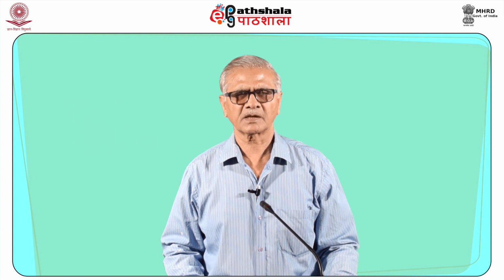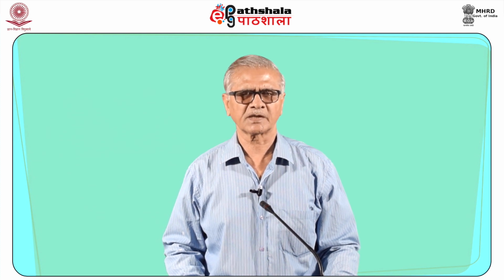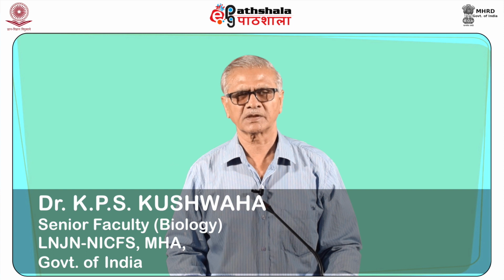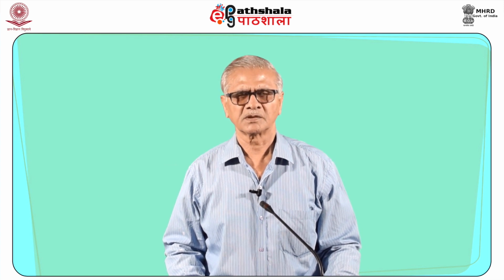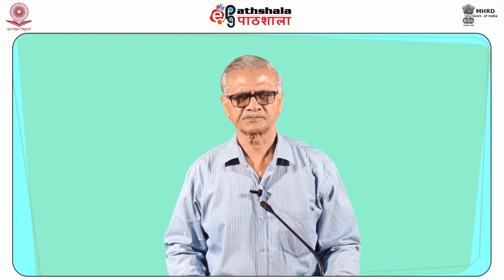Dear friends, in the earlier two modules we had discussed the DNA sequencing techniques. In this third module we are going to discuss second generation sequencing methods.